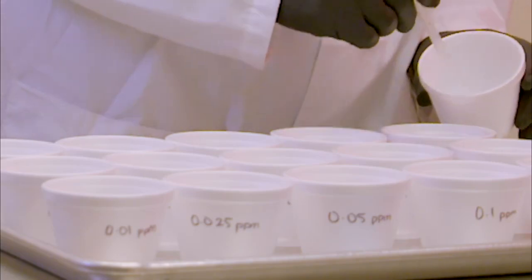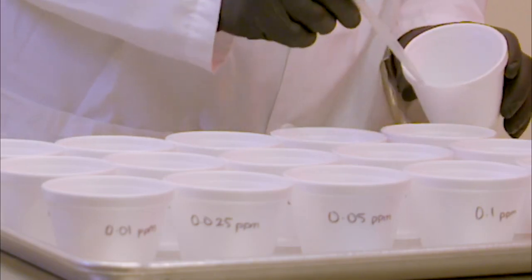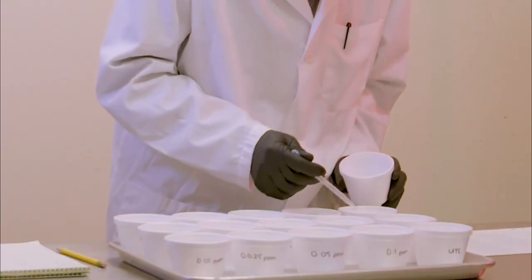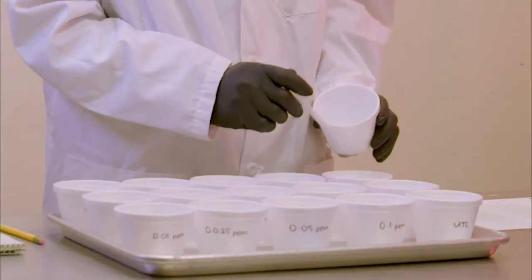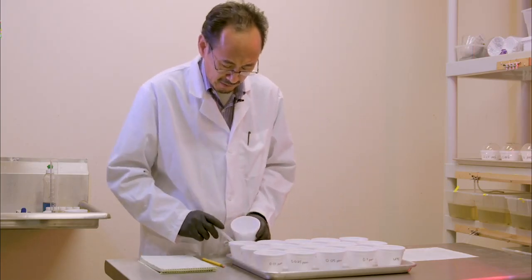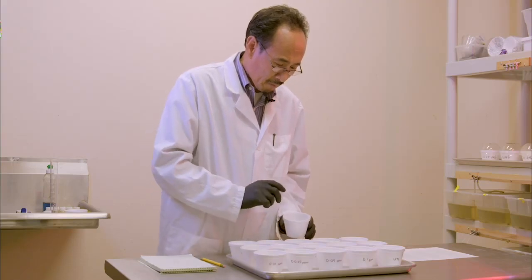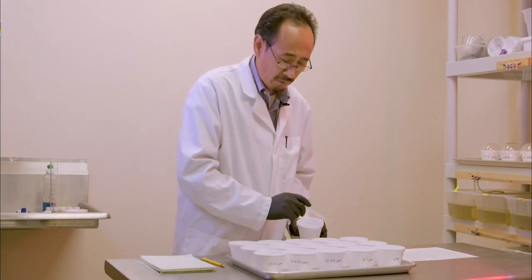air or touching the larvae with the pipette. The lowest concentration will take longer to count because there are more survivors in each cup than in the higher concentrations in the bioassay. You collect and count larvae that are alive. For survivors, well, I'm sure this one is 1 larva dead. Then I remove my lowest concentration, finish these 3, then the second 3. So you always collect the survivors all the way through.